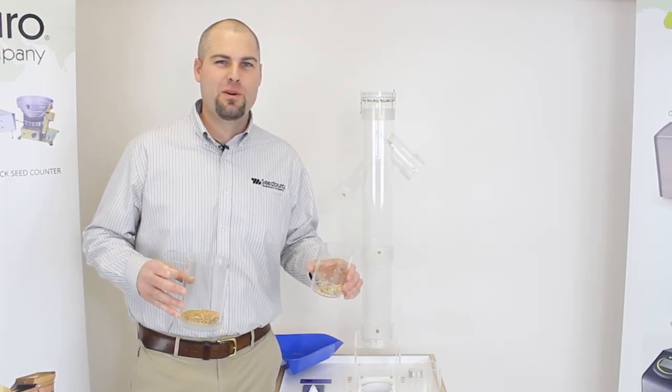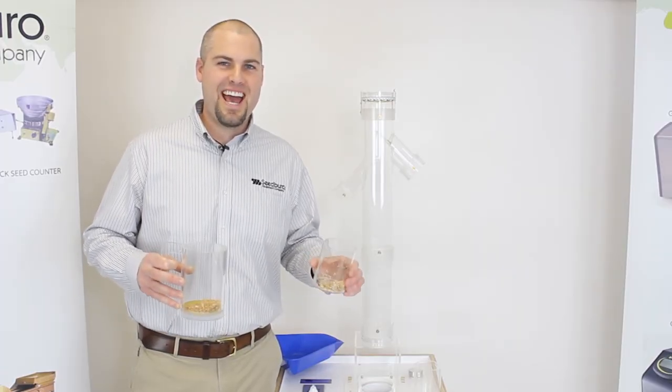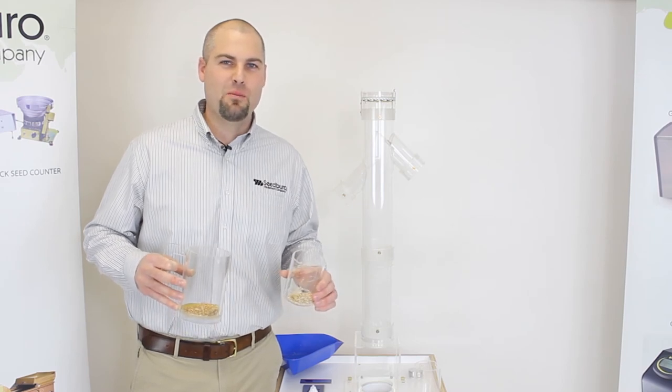Cleaning chaff, dust and debris out of your seed sample is that easy using the South Dakota Seedblower.